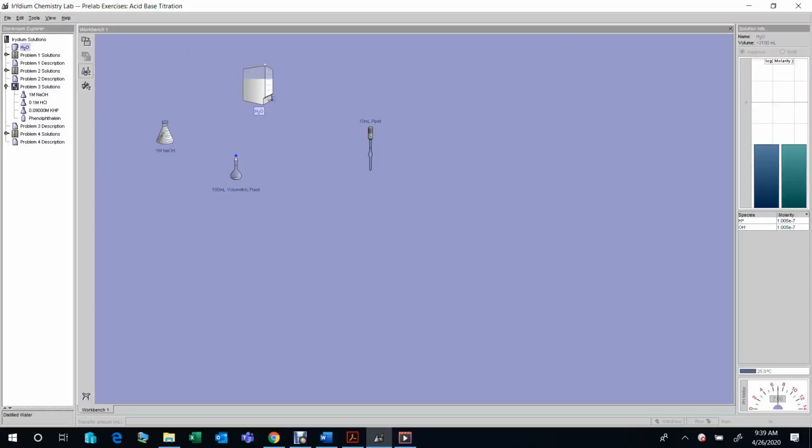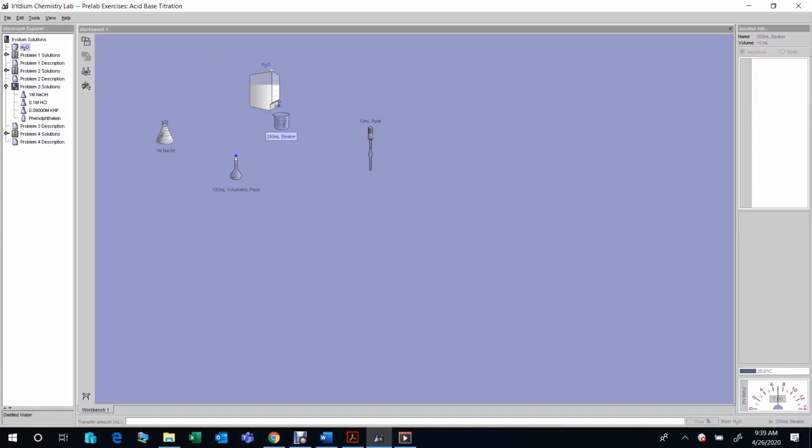To do so, in the real lab, we normally don't just use this tank to pour. We first pour water into a beaker. Here we pour for, let's see. Oh, here, yeah. So we need to transfer water from here, not here to here, because there's no water here. Okay, now we can add 100 milliliter. At the bottom window, we put 100 milliliter.